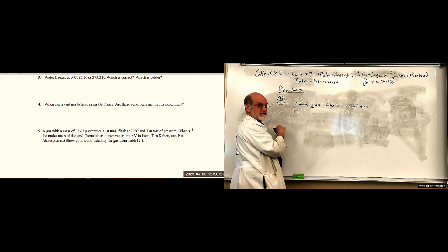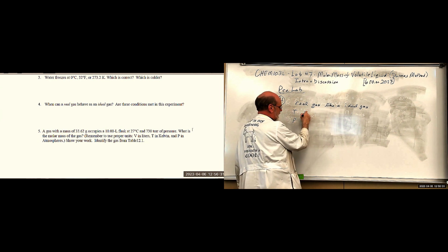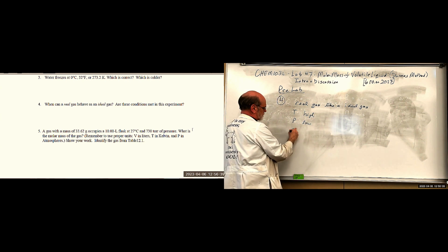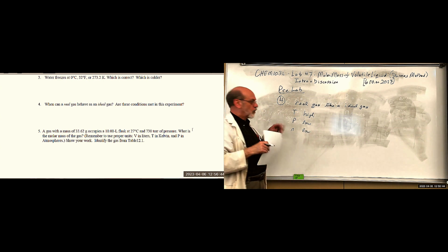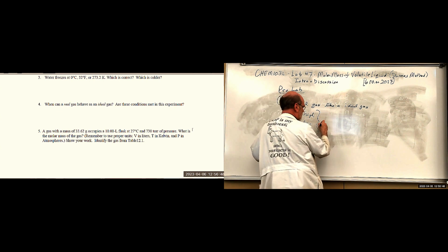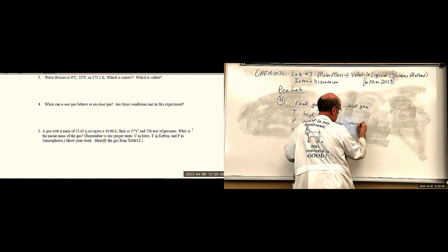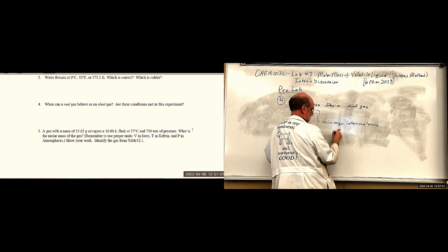Has to do with temperature and pressure. High temperature, low pressure. And I added one, low moles. What you're getting at with all of these conditions is you want to minimize intermolecular forces.